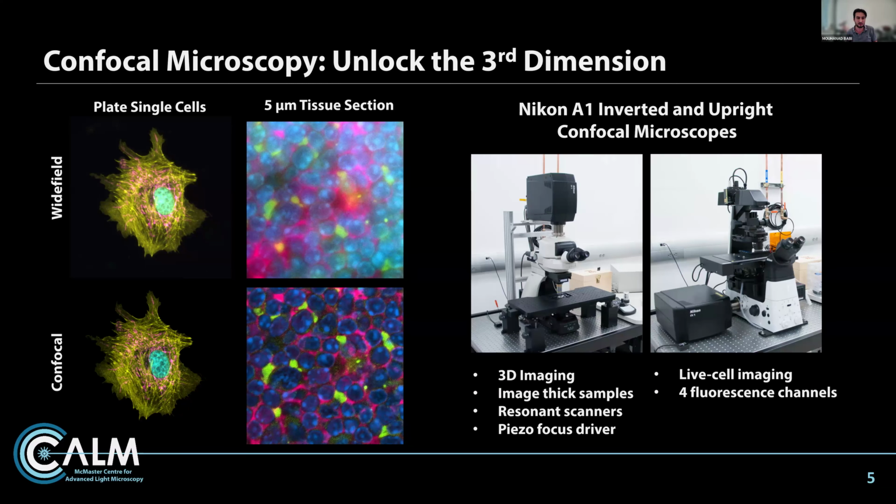And you can get all sorts of different confocal microscopes that can have upright and inverted configurations, and they can have different bells and whistles on them. But typically speaking, a confocal microscope will have 3 or 4 different fluorescence channels that you can use to image your sample. And there's going to be different kinds of confocal microscopy techniques like line scanning microscopy and spinning disk confocal microscopy.